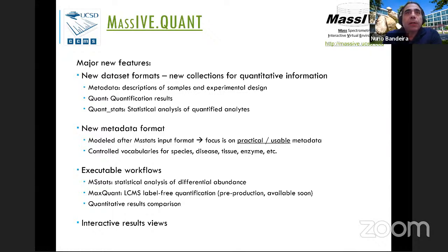There's another question here. Staggered DIA data, okay for MassIVE? Is it better to submit non-demultiplexed raw or converted plus demultiplexed mzML? Great question. I would actually recommend submitting both. You can submit both the raw files as well as the deconvoluted and converted, demultiplexed in this case, mzMLs.